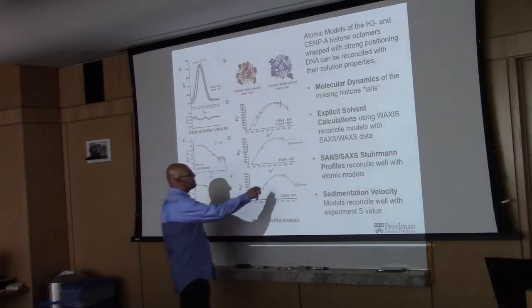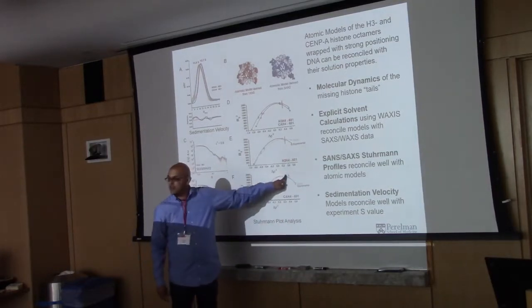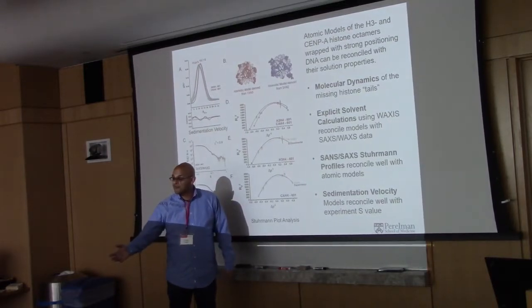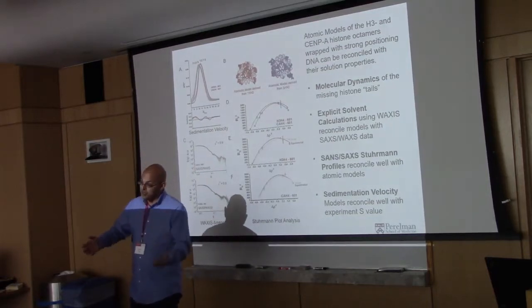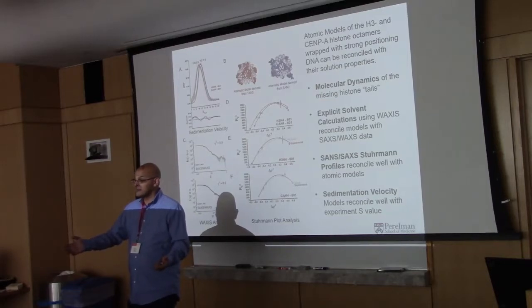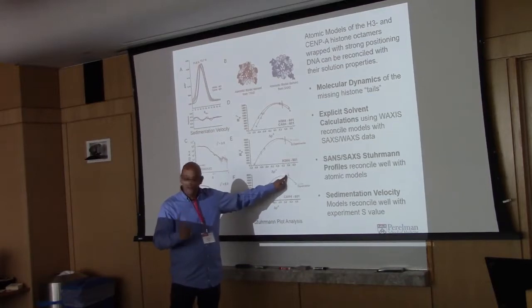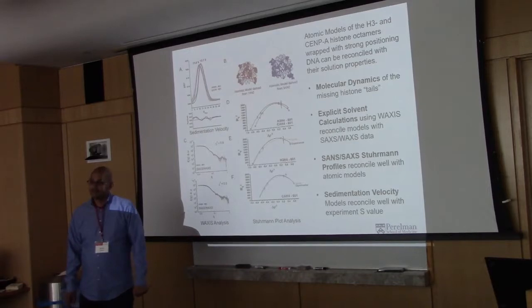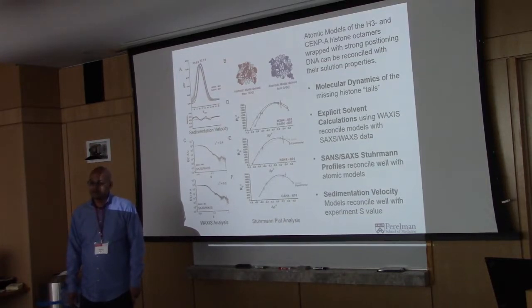It's because it's just this funny situation where all the Stuhrmann profiles for all these varying nucleosomes cross at the same contrast point, which happens to be X-ray. It's a math problem, because not all protein-DNA complexes have the same proportion of protein and nucleic acid. It's going to be different for different systems. But in this case, X-rays are in the wrong place. If they were just over here or over here, I would have seen these differences. So 70% D2O and 20% D2O is the biggest difference in neutrons. Pretty good.